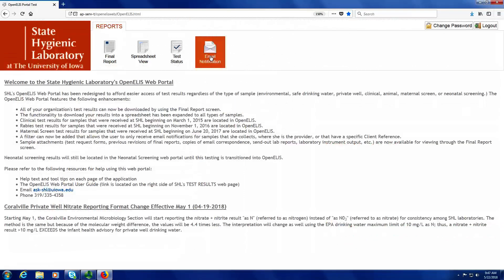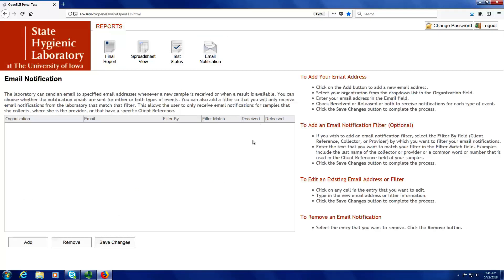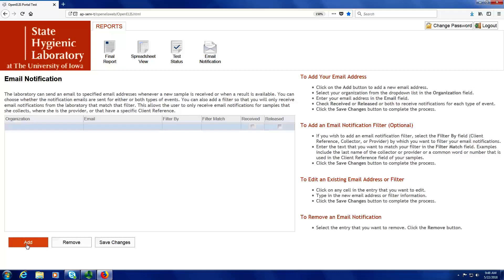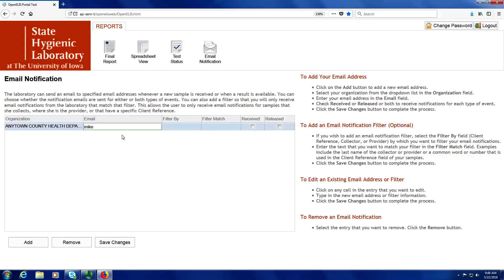The last button, email notification, is an optional feature. I can sign up for two types of emails. The first, known as the received emails, will list the samples that have been received from your organization by the State Hygienic Laboratory. The second type, the released emails, will list the samples that have either had one test or many tests released — in other words, those tests have been finished. In order to sign up, I click the add button, pick my organization from the drop-down list, type my email address, then check either received or released, or both if I want both types of emails. Then I click the save changes button at the bottom.